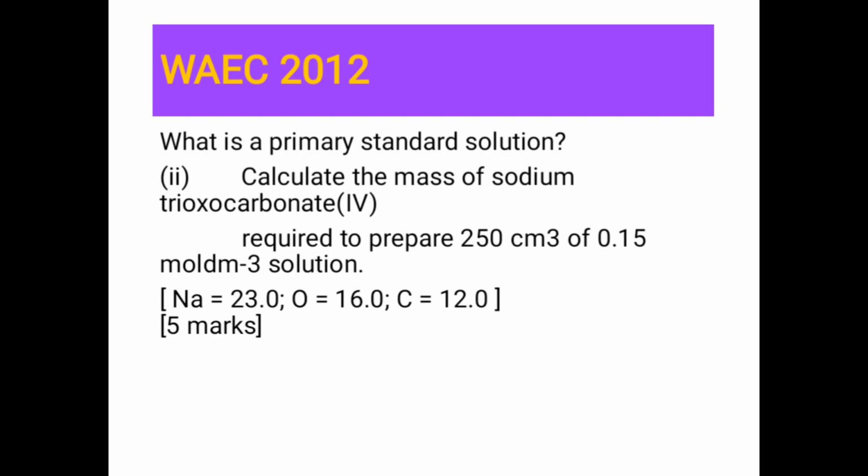So far in this part B, we have looked at how to prepare standard solutions of acids and base, and then we have also looked at how to calculate dilution factor, and then we have also looked at some questions under standard solutions. I hope you have learned a lot in this class. Take time to solve more questions. Ensure you take time to solve more questions as you see them, and of course, if you have opportunity to prepare standard solutions, please ensure that you follow the required procedure and all what we have mentioned in this video.